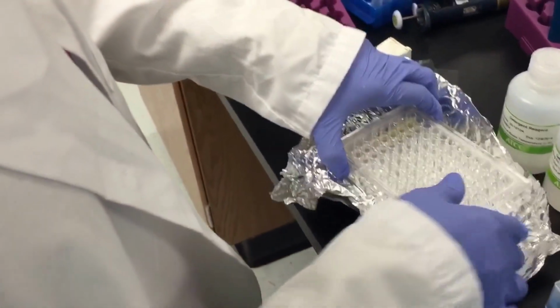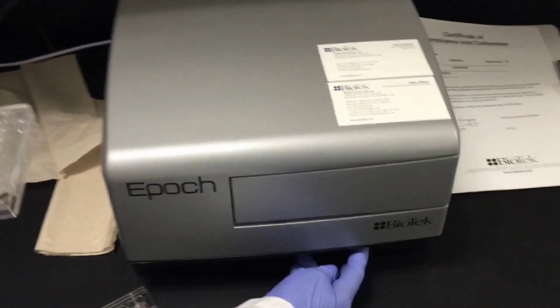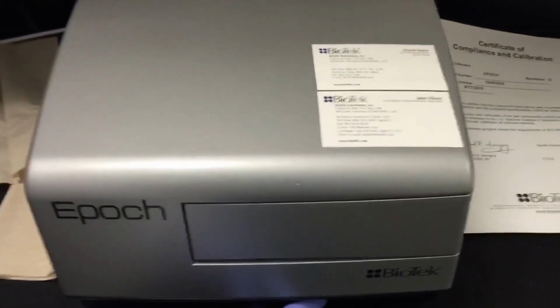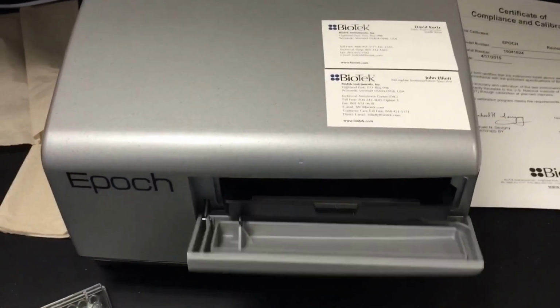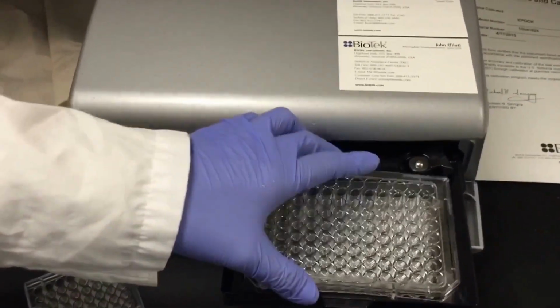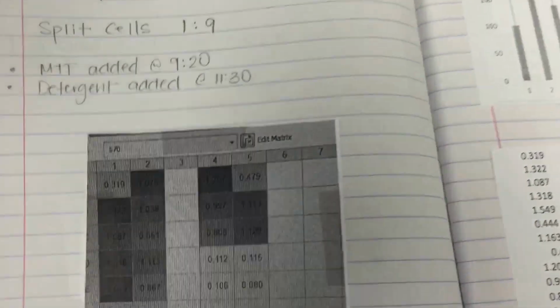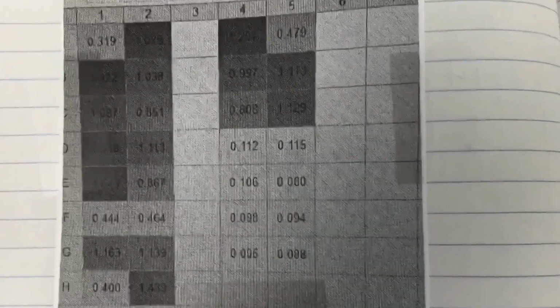And you bring it over to the spectrometer machine. You'll be placing it into this machine and it will pop out, and you can put the plate in and it will give you the reading. Okay, after you do your reading, you take a picture of your readings.